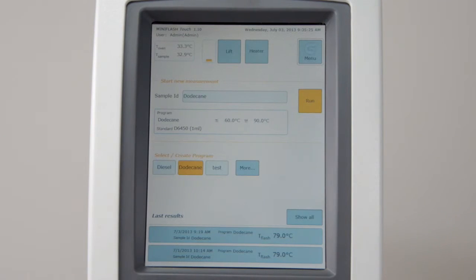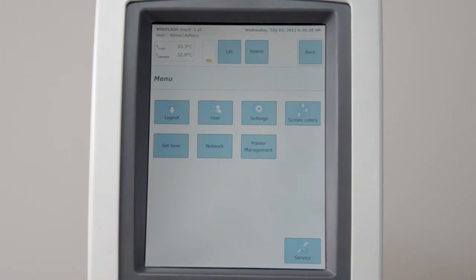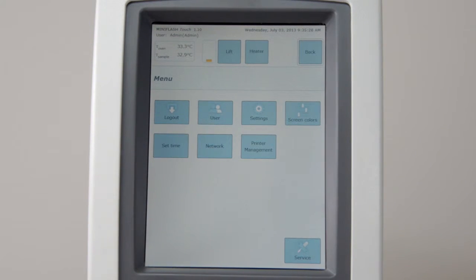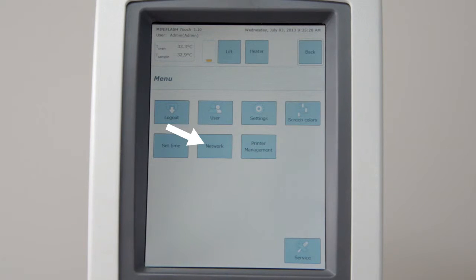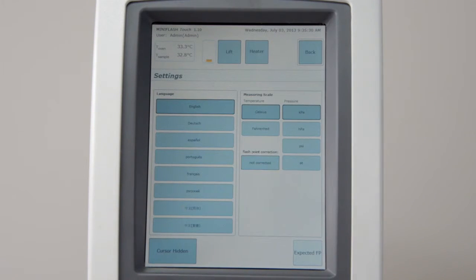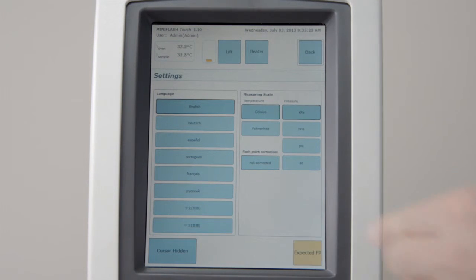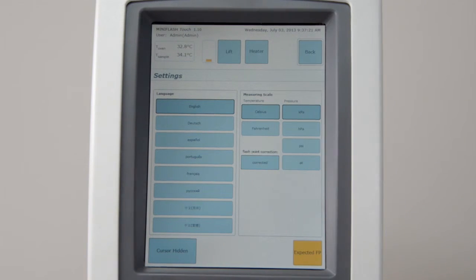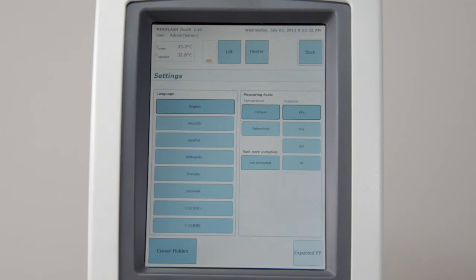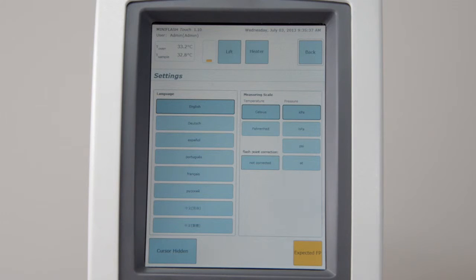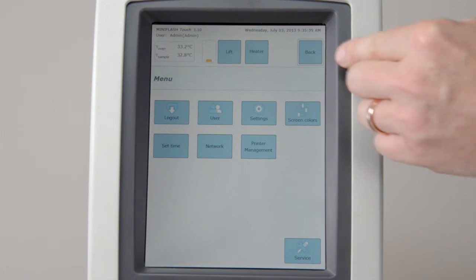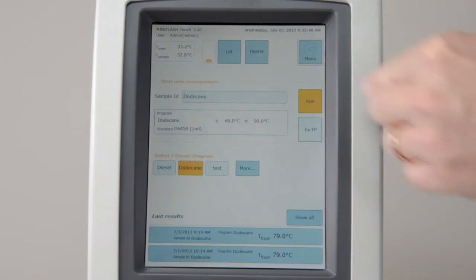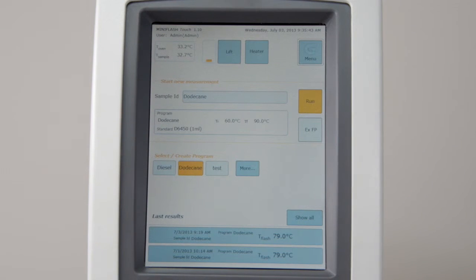Click on Menu to create new users, to change instrument settings, or to configure a network or a printer. Enter the Settings menu to change language and measuring units, or to activate the barometric pressure correction. Here, you can also activate the expected flash point. If you enter an expected flash point in the measuring screen, this will automatically change the initial and the final temperature of your test program.